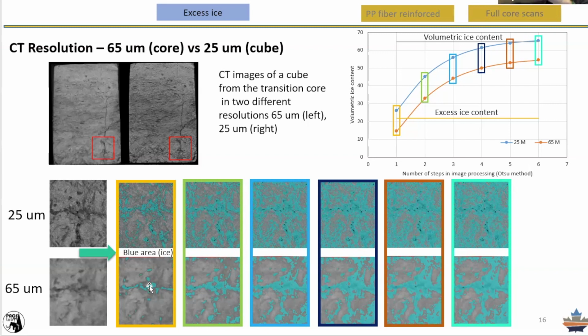If you are looking at the surface of that, you can find the surface. So all of them is just the options of the software, which will give you the volume of that whole interval in your whole sample. Okay, and you compared what you get from this with the cuboid method.